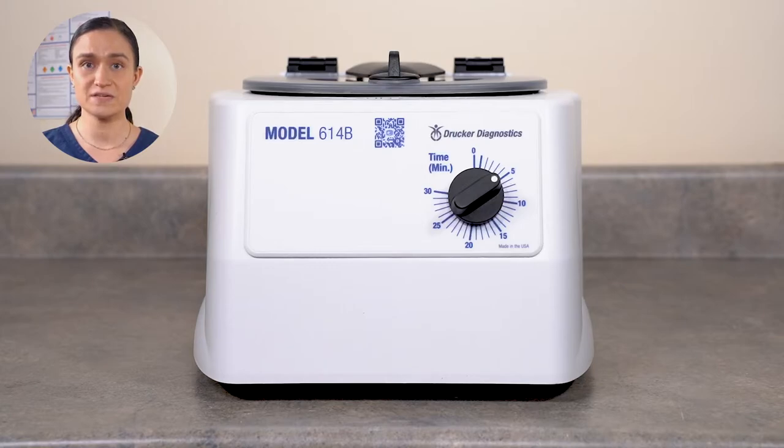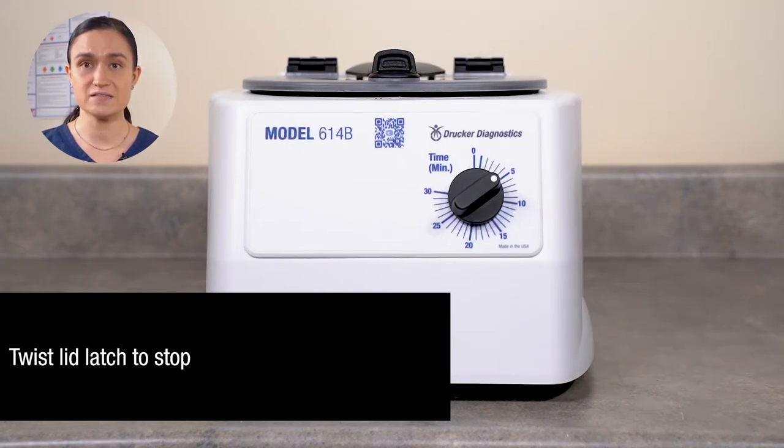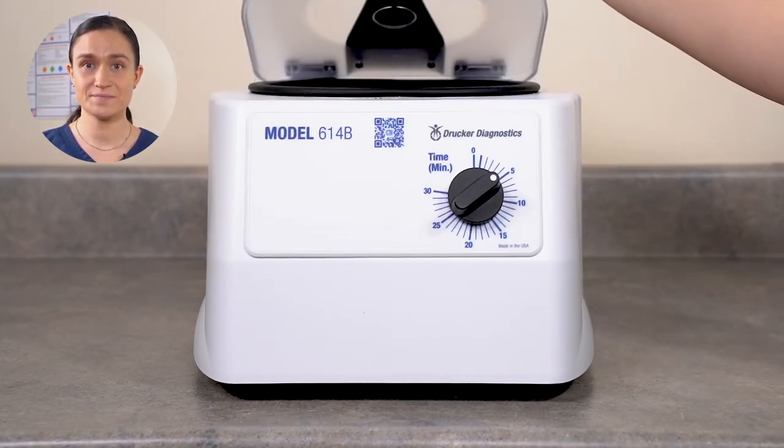The rotor will begin to accelerate and the centrifuge will run for the time selected before slowing down. To stop the centrifuge mid-cycle, simply twist the lid latch. The rotor will immediately begin slowing down. Once it has come to a full stop, you may open the lid and retrieve your samples. And those are your controls.